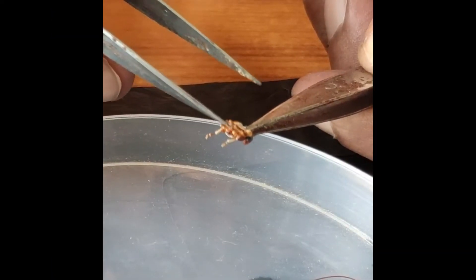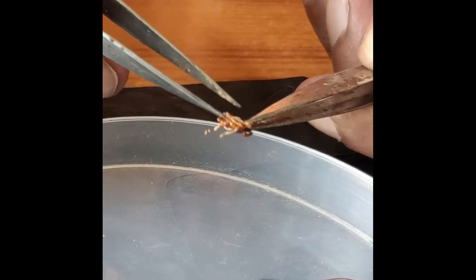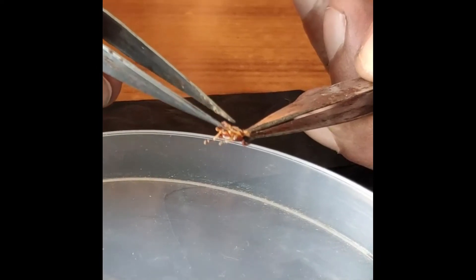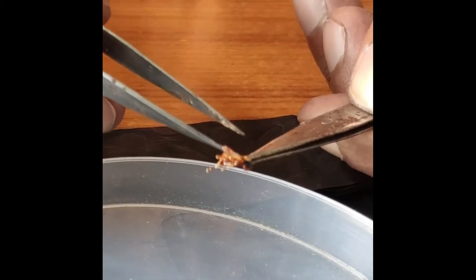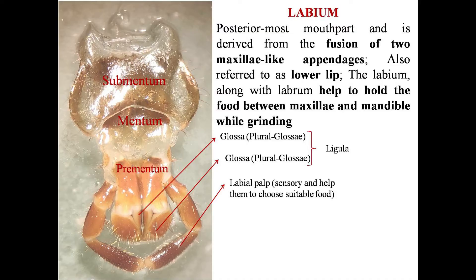Now I'm trying to insert one arm of the forceps inside the labium, reaching to the proximal-most portion of the labium and pulling it out. This is the whole labium, and labeling of the different portions of the labium is indicated here as you can see.